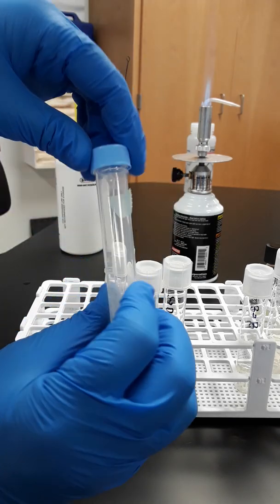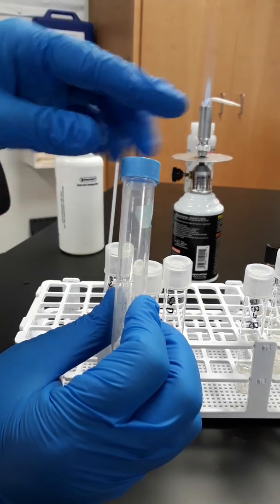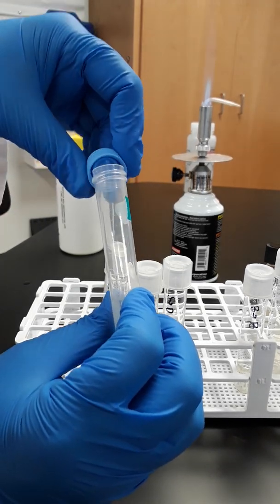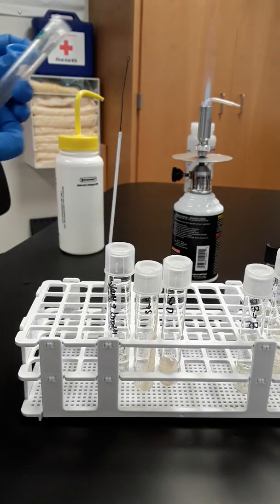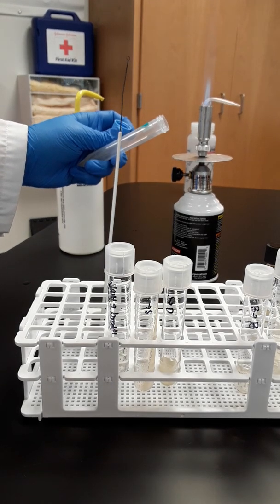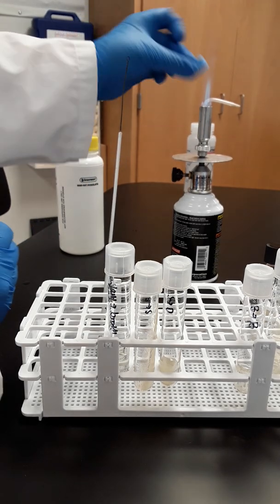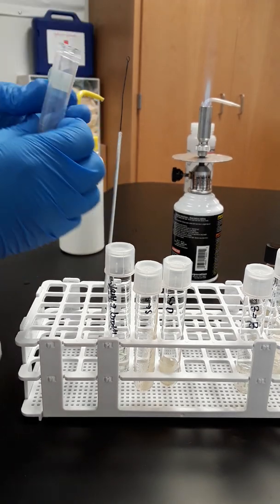You see this is the interface where the sterile and the non-sterile meet, kind of. Maybe there's some dust or debris there. So what we want to do is, after we separate them, run it through the flame very quickly. 1, 2, 3. Very quickly, or you will melt the plastic. And you do the same with the cap. 1, 2, 3. Okay, so now this is ready to transfer.